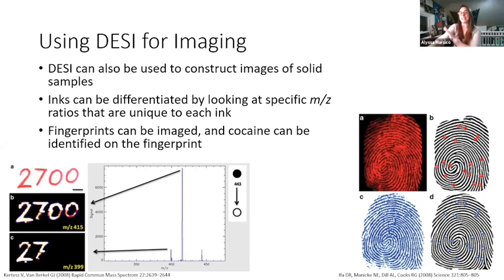I'll get into how imaging mass spec works in a second. It's very complicated. To get an image like this for this fingerprint, looking at the level of detail in this, there's probably about 10,000 to 100,000 mass spectra that were used to generate this image. I have a laptop just dedicated to grad school because my analysis and result files are massive. I'd have an imaging run that would take like a terabyte of data. It's insane because there's a lot of information here, but I'll explain it in a second.